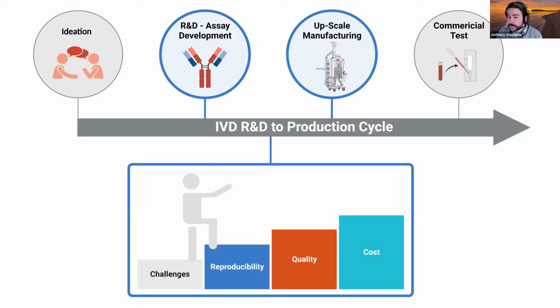And lastly, sometimes people just want to do R&D on antibodies. Sometimes having a good proof of concept molecule can really serve us before we engage in a lot of custom antibody development work. So perhaps you're looking to develop a bispecific antibody. You just need a good antibody that binds to your one arm. You don't want to make a custom CD3 antibody, for example.